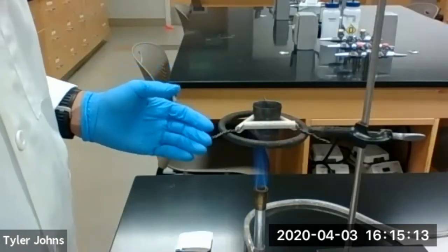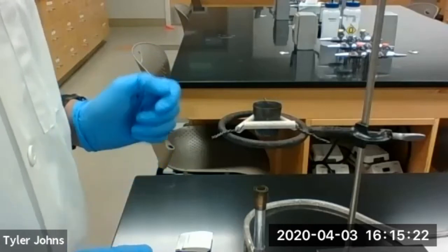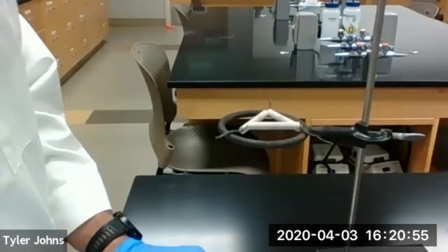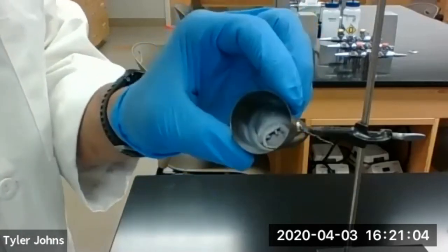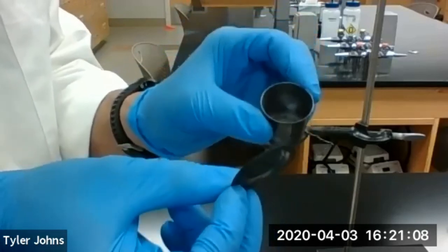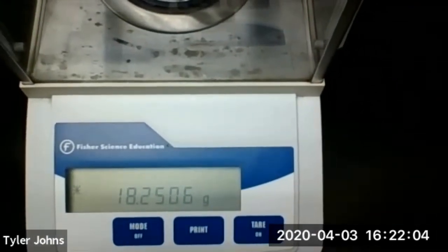We've let the crucible heat moderately for 10 minutes, so we're going to turn off the Bunsen burner and allow the crucible and the magnesium oxide inside to cool until just warm to the touch. We've allowed the crucible to cool, so now we're going to weigh the crucible, the magnesium oxide inside, and the crucible cover for trial number two. The mass of our crucible, cover, and magnesium oxide for trial number two is 18.2506 grams. You should now be able to perform the necessary calculations to determine the empirical formula of magnesium oxide. That concludes this lab — thank you for joining me for the empirical formula of magnesium oxide lab.